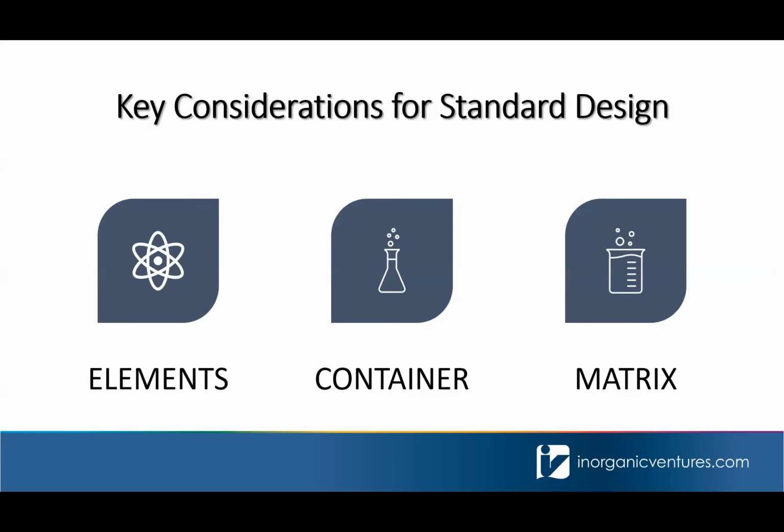Regardless of the approach that your lab takes, there are some key considerations that go into designing calibration standards. First, I'll talk about inter-element compatibility, which is just talking about which elements get along with one another, and those that may need a little special attention. Then I will describe how container properties influence solution stability. And then finally, I will discuss how the solution matrix plays a role in working standard design.